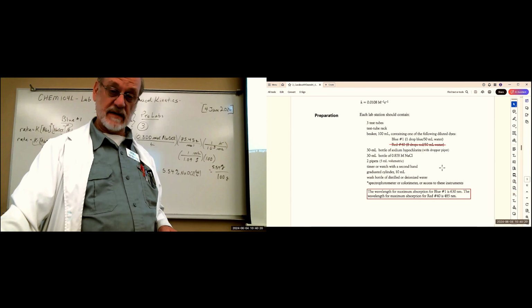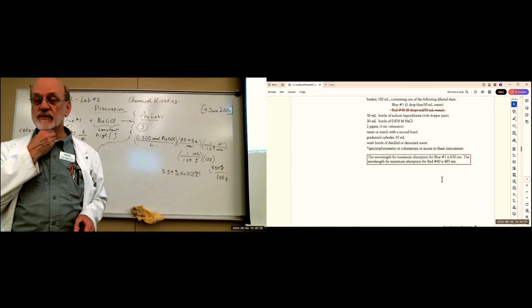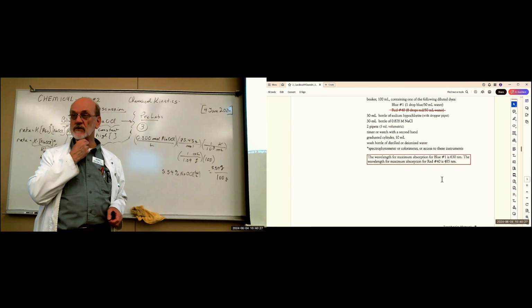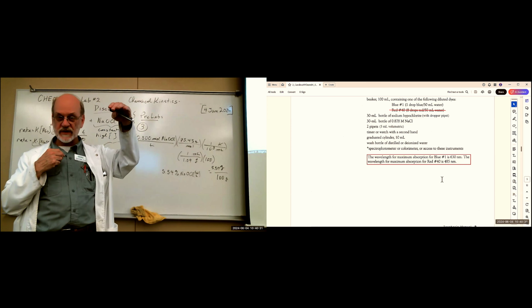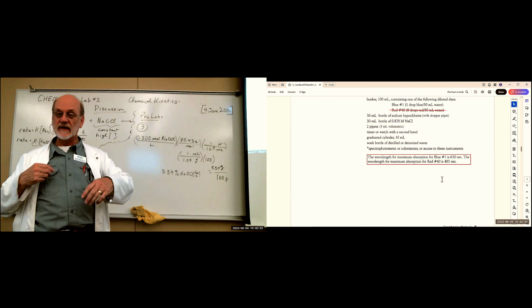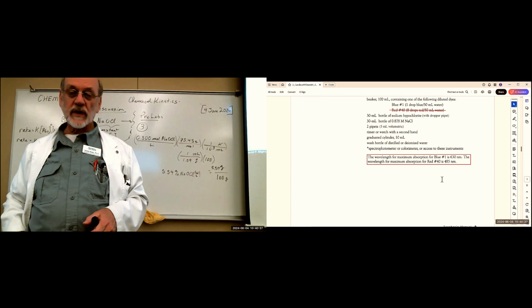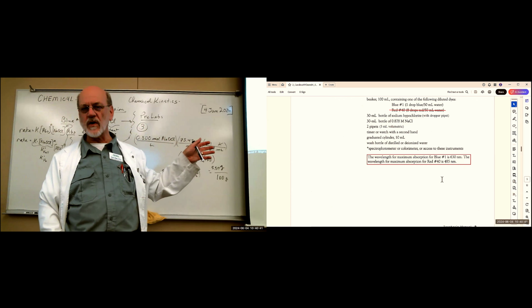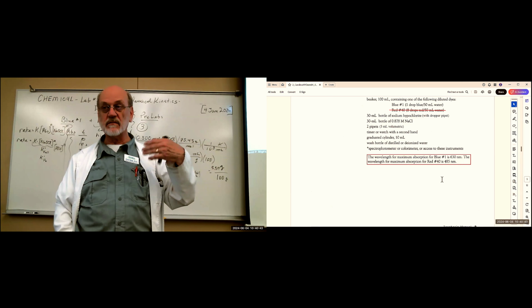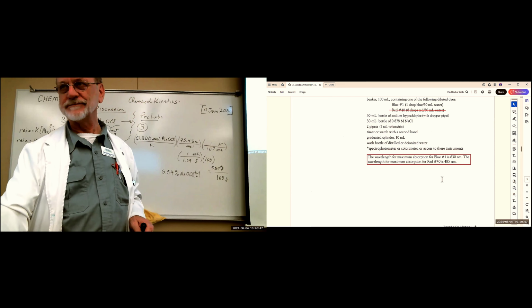There's your wavelength. We're going to use a spectrophotometer to measure the optical density of our solution, and you'll see the value of absorbance going down, down, down over time at 630 nanometers. When I set the lab up Thursday, I'll turn the spectrophotometer on and set it to 630 and let it warm up, because they like to be warm when you first use them.